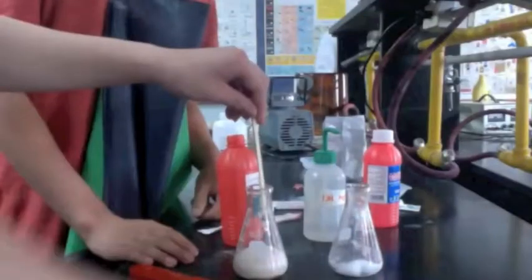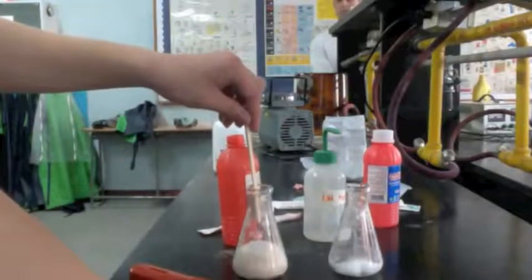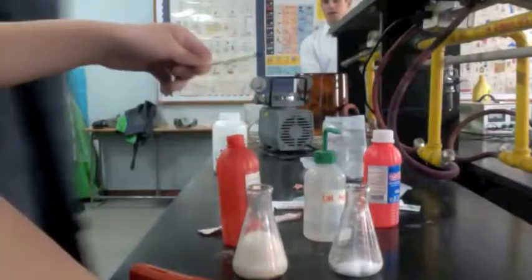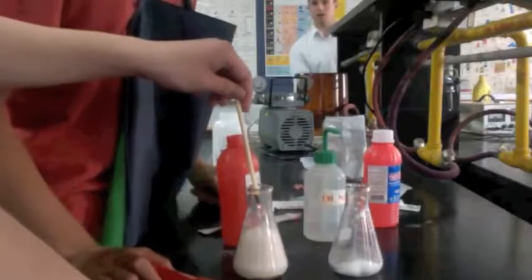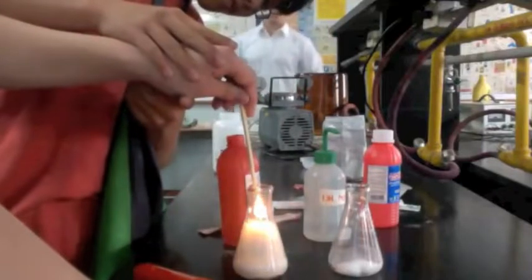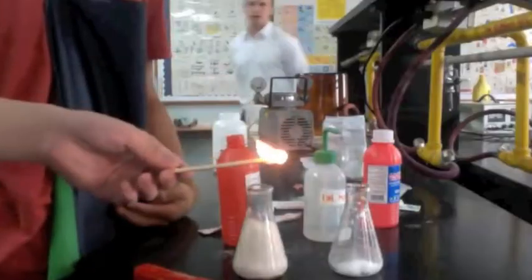And as you can see here, the flask with the baking soda and the hydrochloric acid produced enough carbon dioxide to put out the open flame. However, the flask with the hydrogen peroxide and the dry yeast reacted much more slowly than the baking soda. As a result, the production of the oxygen was much slower than the production of carbon dioxide. However, as we can see here, as time passes, there is more oxygen getting produced, which is the reason why the ember ignites back on fire.